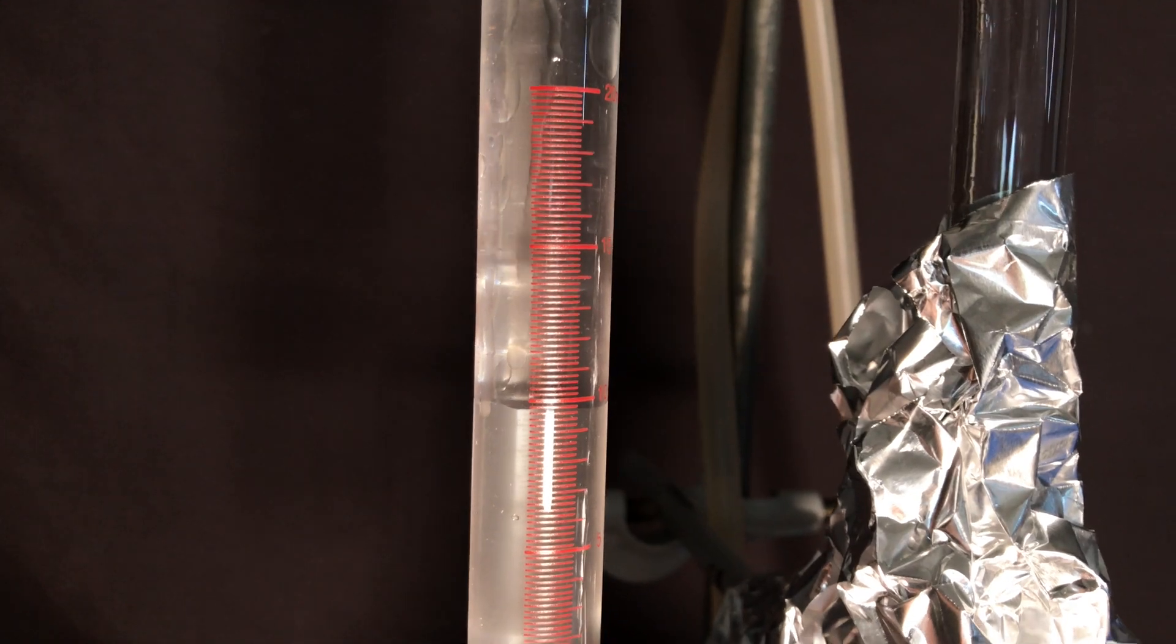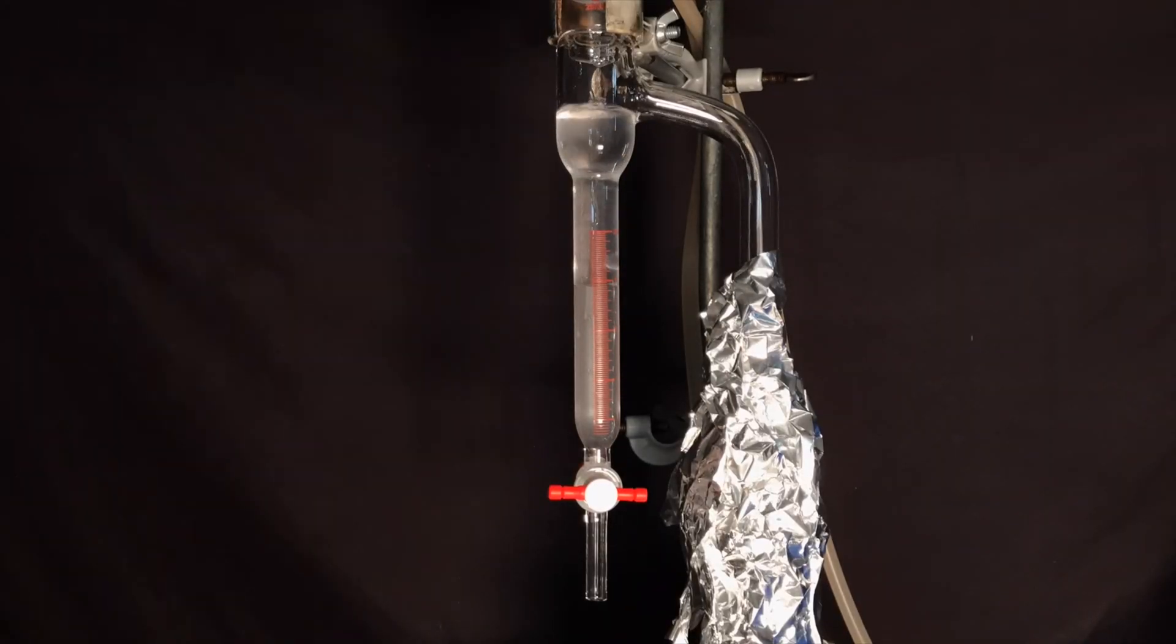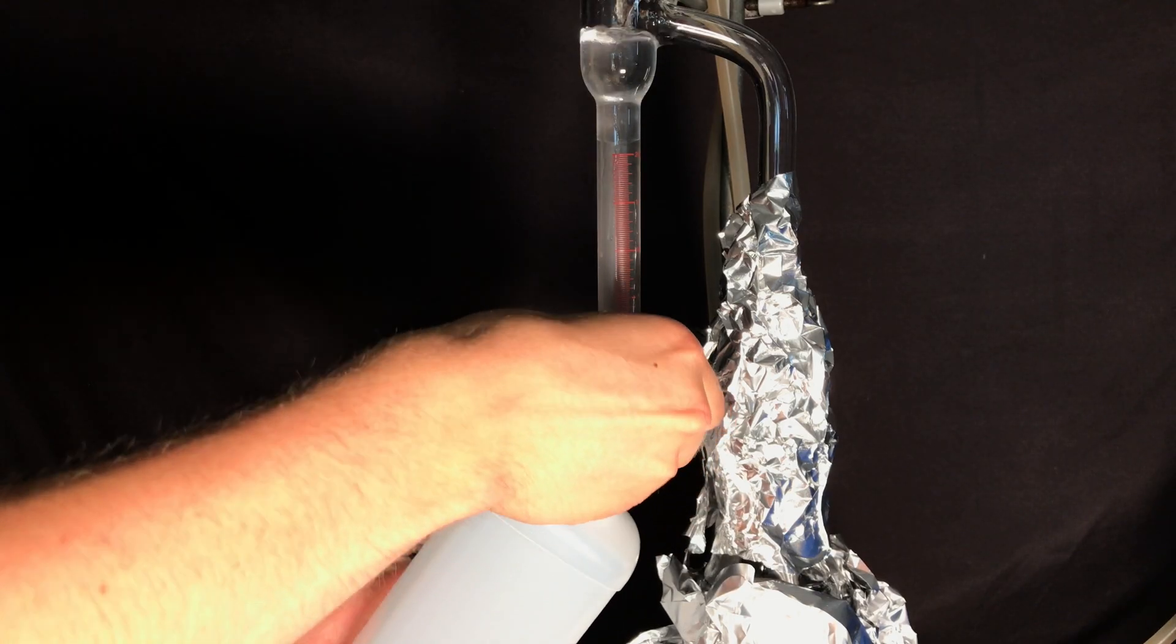Up at the condenser you can see the benzene and water azeotrope condensing and flowing down. The layer of water collects at the bottom and it should get thicker over time.